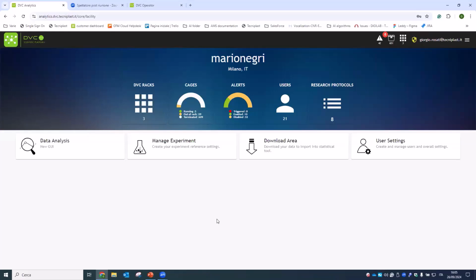During this hour of training session or webinar, I would like to cover the two most important parts. Very quickly, the administrative workflows, explaining to you how to register a new user, how to share cages, and so on. Most of the time, these are very important questions, especially at the beginning of using the DVC Analytics.